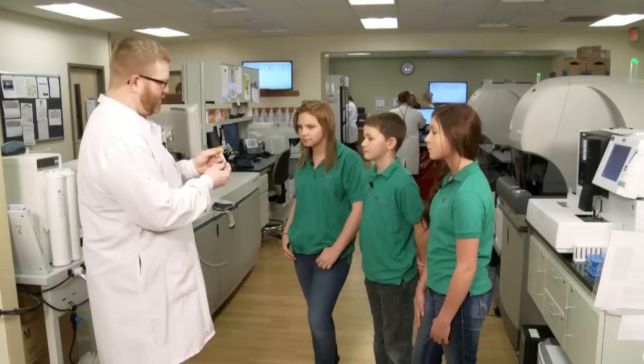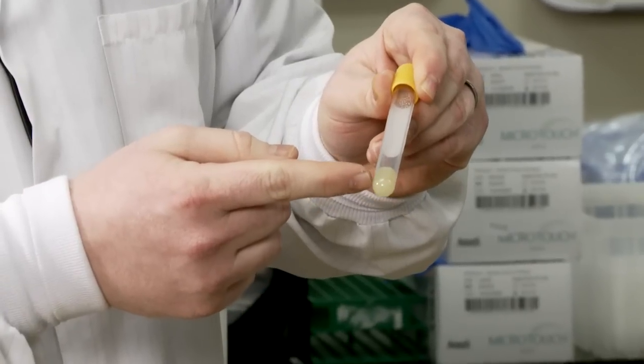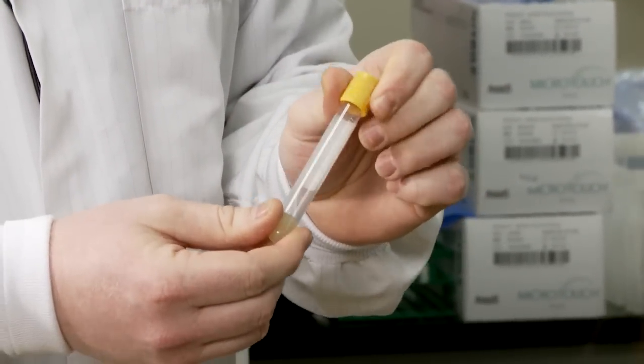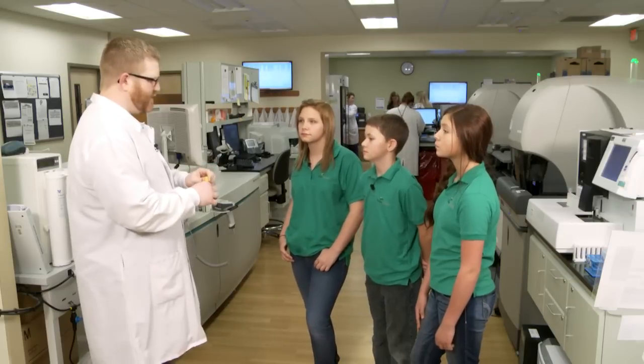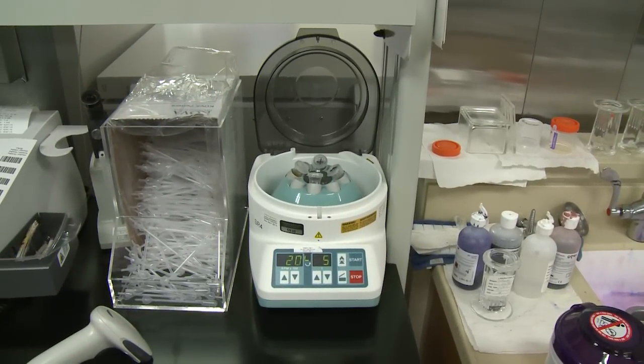So we use a tube like this with a gold top. You'll see there's something at the bottom already — that's a gel. With these tubes, what we do is we put them in a centrifuge. A centrifuge has lots of little holes inside, we close the lid, and it spins the tubes around really, really fast.